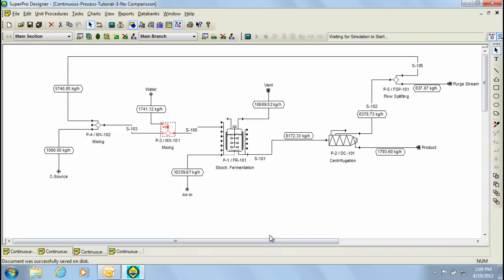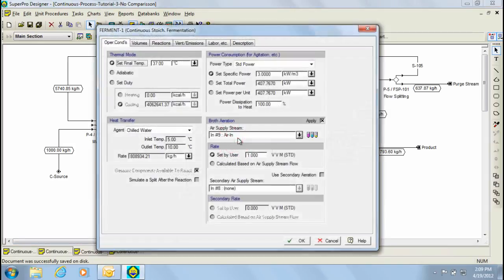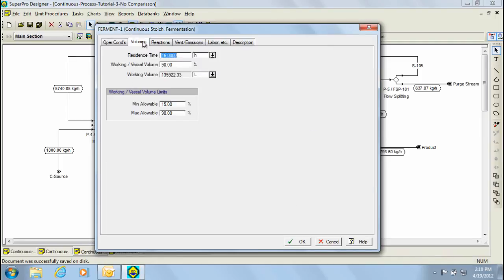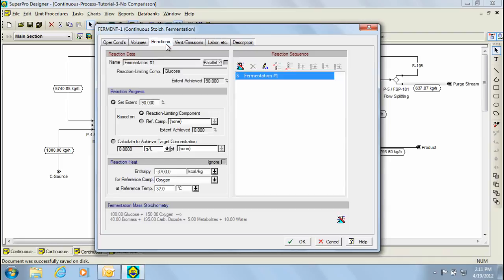Next, we have a fermenter where fermentation is carried out. Fermentation was modeled as a simple continuous stoichiometric fermentation operating at 37 degrees Celsius with air supplied at an average aeration rate of 1 VVM. Through the volumes tab, the average liquid residence time was specified at 16 hours. If we now switch to the reactions tab, we can view the stoichiometric reaction used.